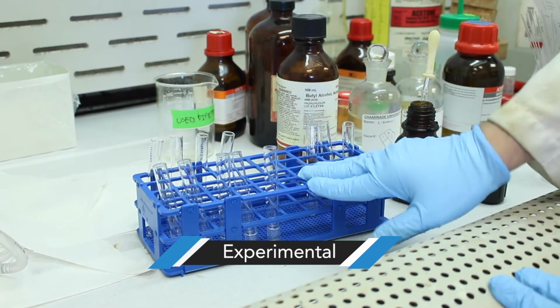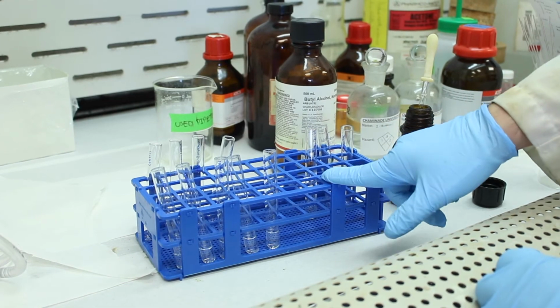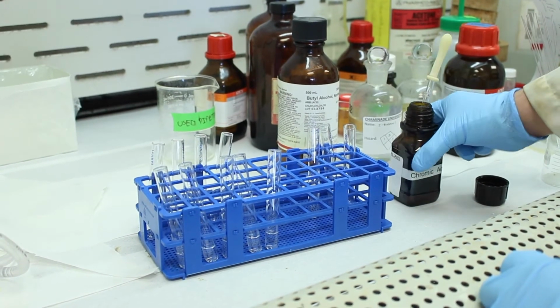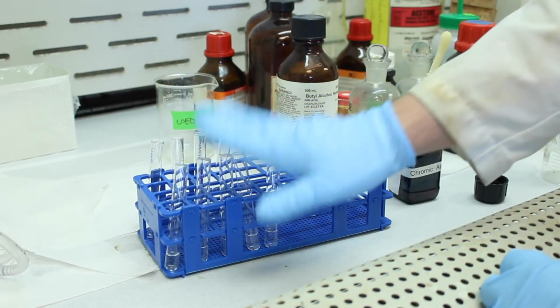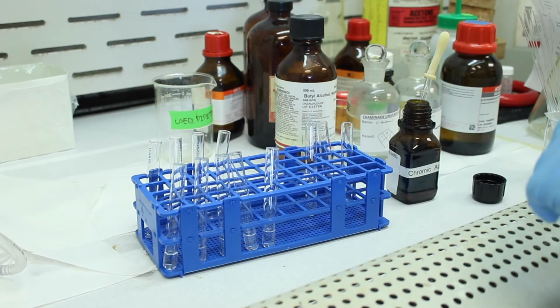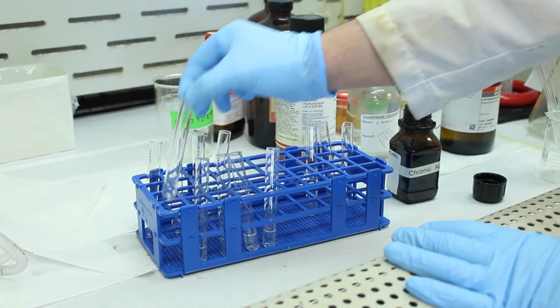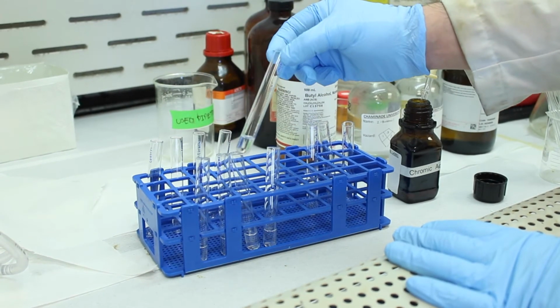All right, so we're in lab now. We've got our test tubes. So these are test tube tests. The first set of tests we're going to do are our chromic acid tests. We're going to go in the same order. So we've got 5 tubes here. One is going to be our control, and we're going to test 4 different compounds. We're going to test 4 known compounds, and we're going to observe what we should see in a positive or negative case.